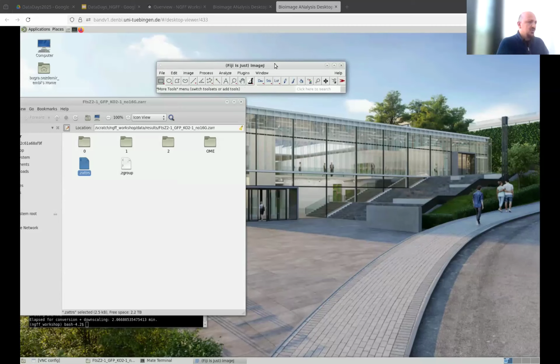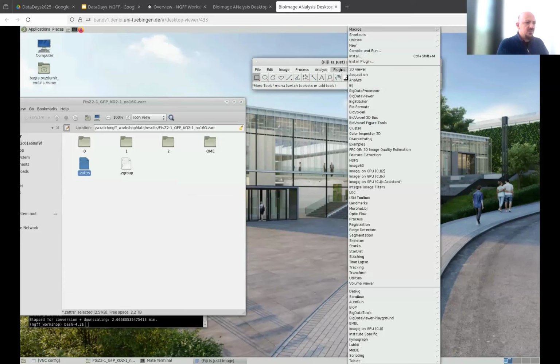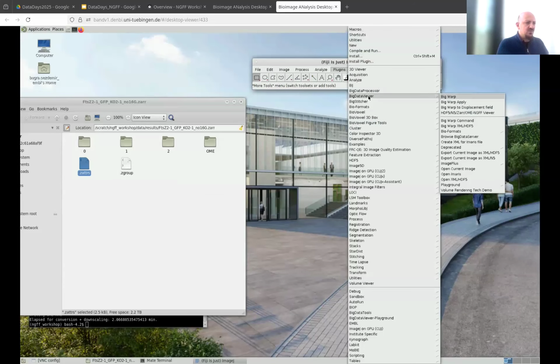Yeah. So the next tool that I would like to demonstrate is the Big Data Viewer integration with OME-Zarr. So you have basically the same name, this HDF5 N5-Zarr OME NGFF viewer. And the aim here is to really open the entire multi-scales.